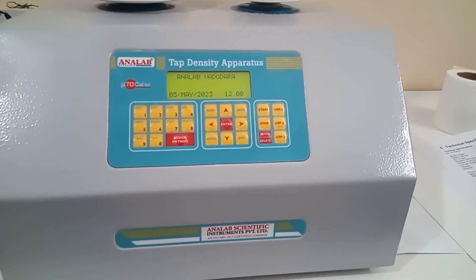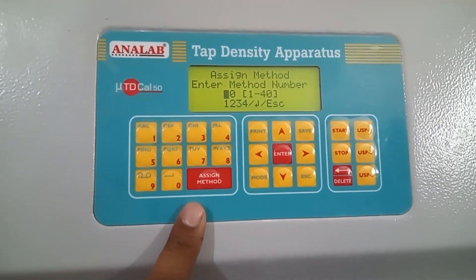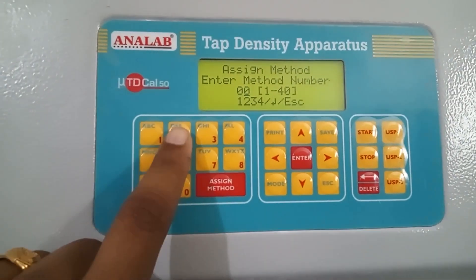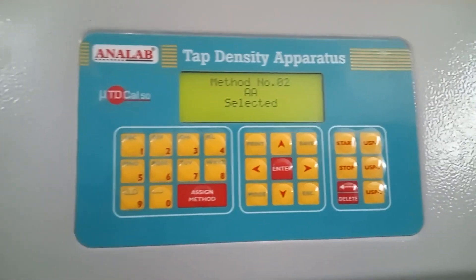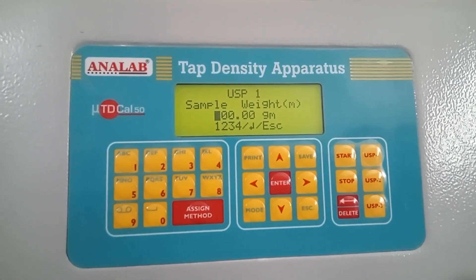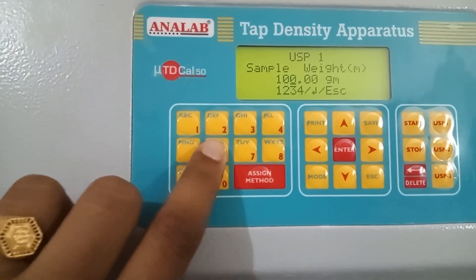Now let's start with assigning the method which we have created. That's the shortcut button on the keypad for assigning the method. When we press the button, the instrument will prompt for entering the method number which we have previously created. Right now I have created the second number method, so I will press 02. Then when I press enter, the instrument will show the method name and it will ask to enter the sample weight. I will enter the same using this keypad.